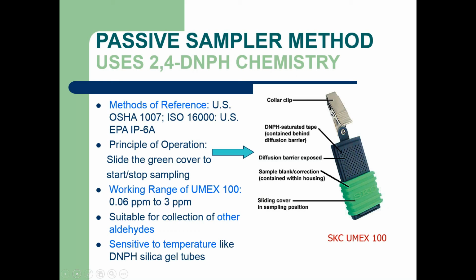Keep in mind, like DNPH-coated tubes, DNPH-based passive samplers are sensitive to temperature. Background levels will rise with prolonged exposure to even ambient temperatures. We normally ship expedited or just with a cold pack.